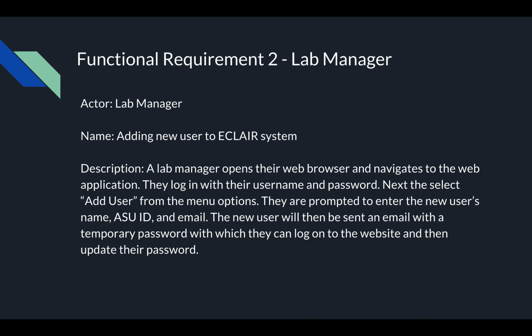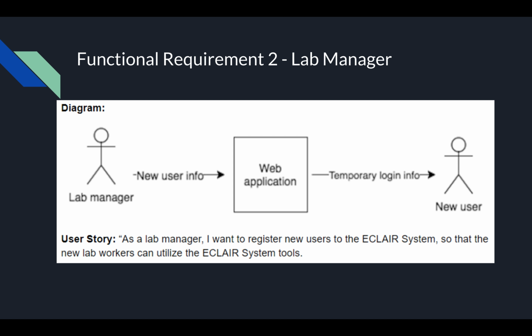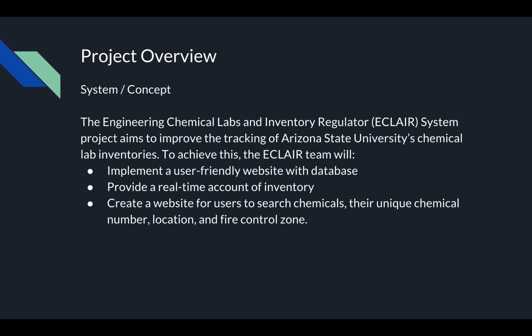Second would be the lab manager. One of the lab manager's use cases is adding a new user to the ECLAIR system. So they would add the new user info into the web app, and the login info would be sent to the new user.